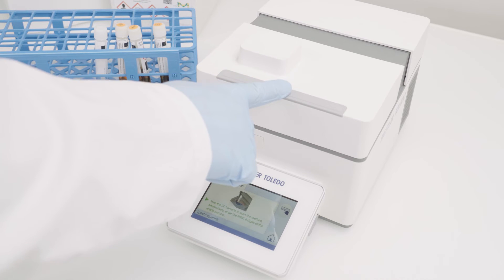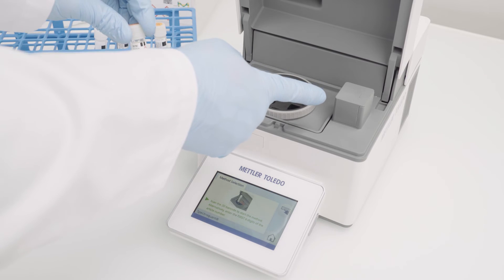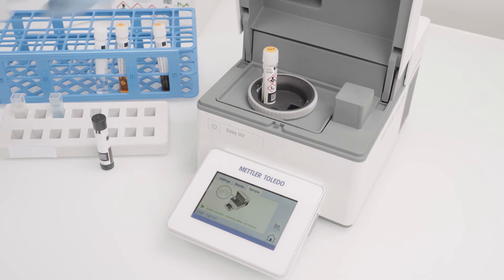Open the lid and scan the barcode of the test kit. The method starts automatically. By closing the lid, the measurement starts immediately.